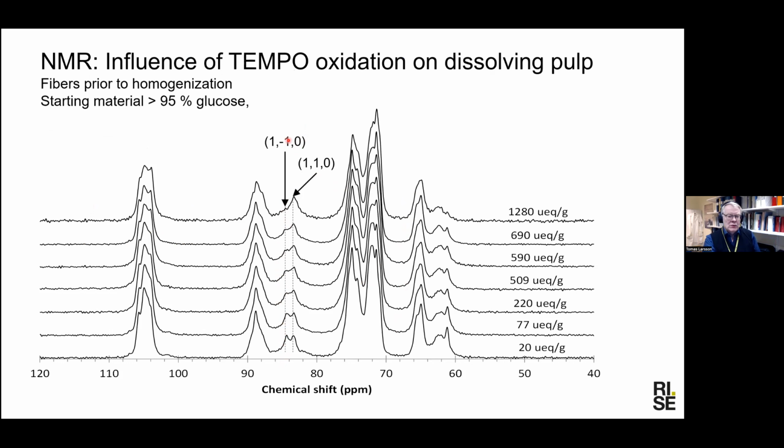So for that reason, we concluded that yes, we have this signal at around 84.3. That's the 1-10, the polymers constituting the surface residing on top of the 1-10 plane, and the other signal is correspondingly 110.